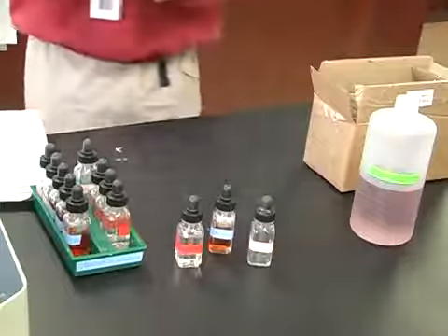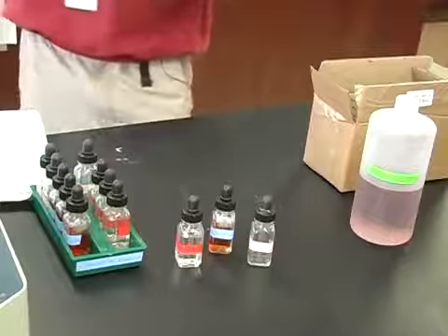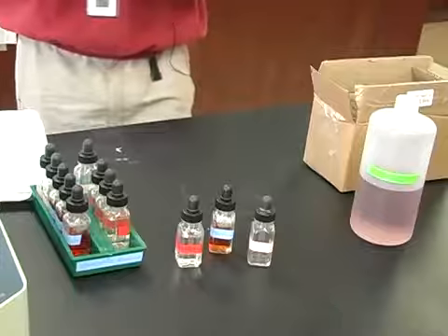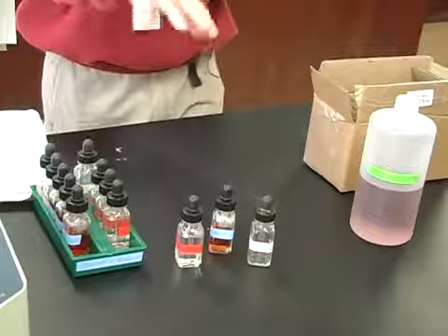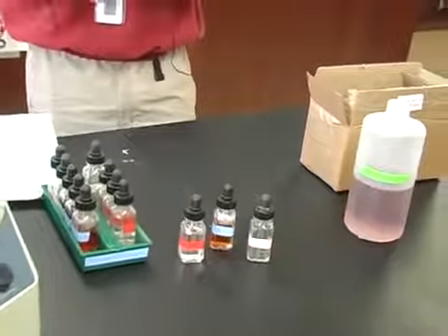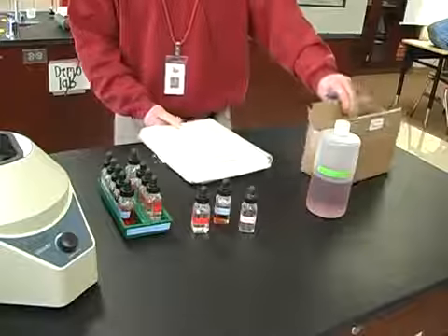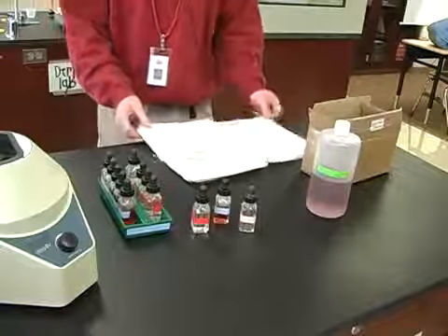We have 7 different lab stations in here. Each lab station will have a set of chemicals that people can use. There are a few chemicals that you don't use very much that won't be at every single lab station, but most of them will have a majority of the chemicals that you need.